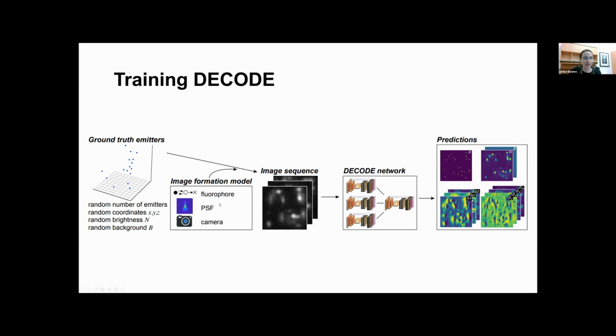But then what happens is it builds itself up according to your specific problem. These predictions are then compared to the ground truth which you've put in, and based on the loss function which you create, which is in principle nothing else than a function which needs to be minimized.